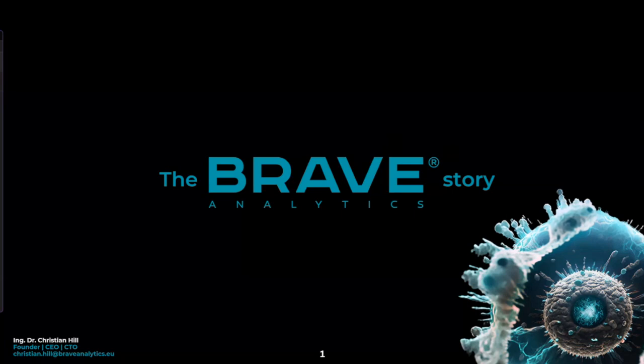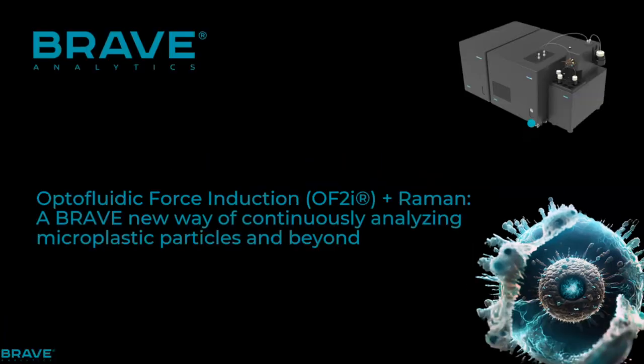I guess people already know my first slide. It's always the BRAVE story. The BRAVE story is now a 5-year-old story, and we are still as excited as we were at the beginning. And today it is really about optofluidic force induction plus Raman and what you can really do with it in microplastic particle characterization and analytics and beyond.